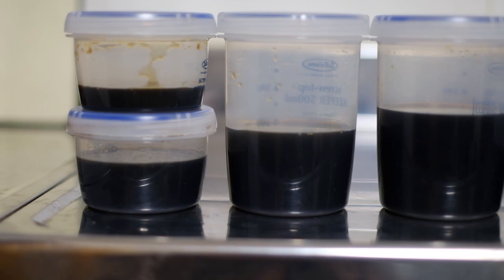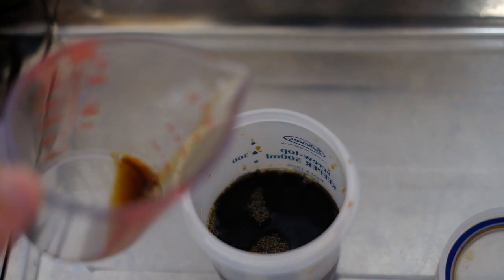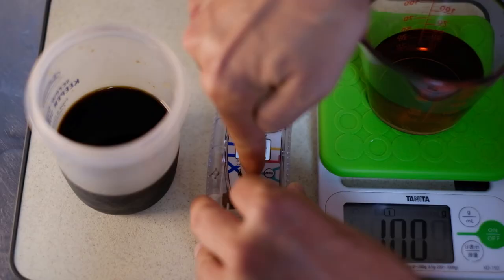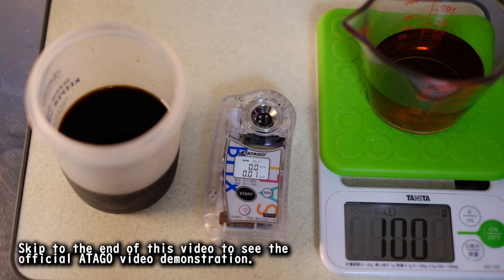It's important to dilute your tare before testing. Simply make a 10-to-1 water-to-tare solution and you'll be good to go. This new Atago Pocket Brix Salt Meter has a neat function: once you develop your recipe, you can save it into the device. Run a couple of tests at different dilutions and now it's all in the system to stay.